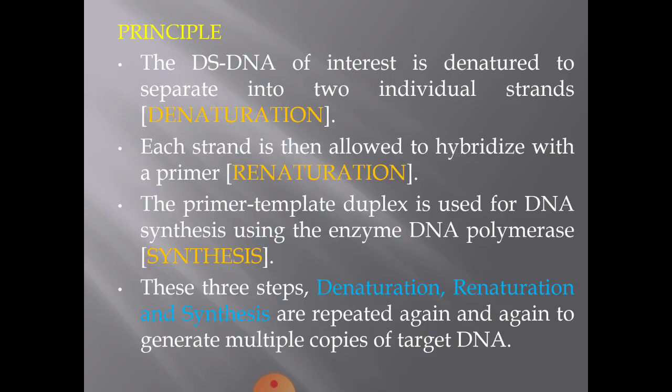Okay? So, denaturation is separating the two strands of double-stranded DNA of interest. Then, hybridization of each strand with the primer is called renaturation.